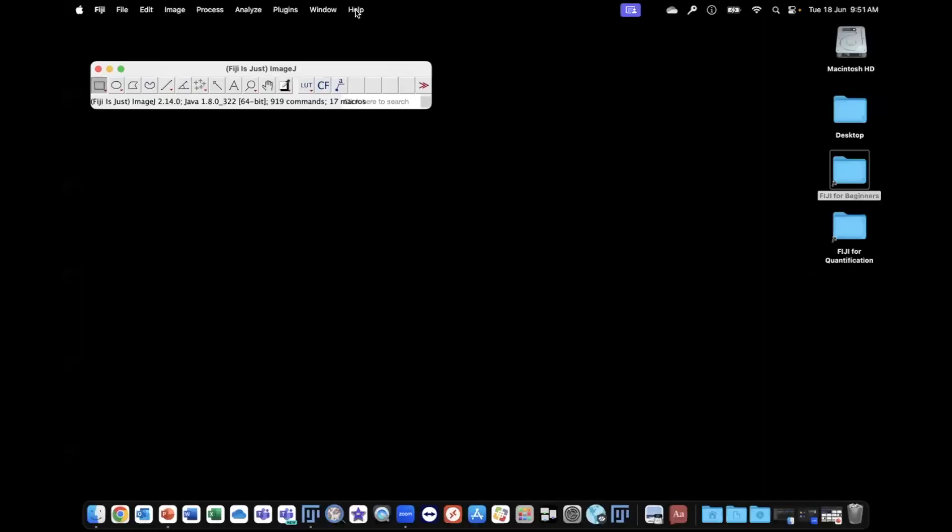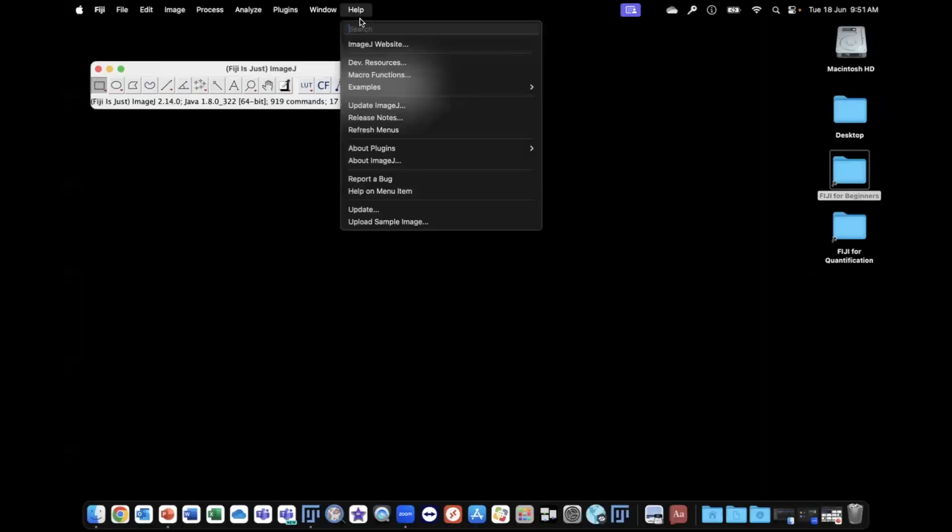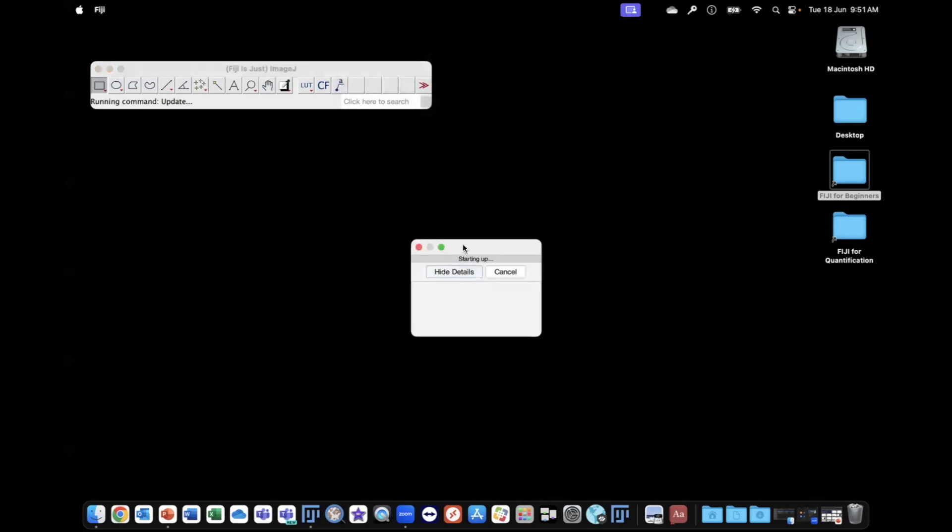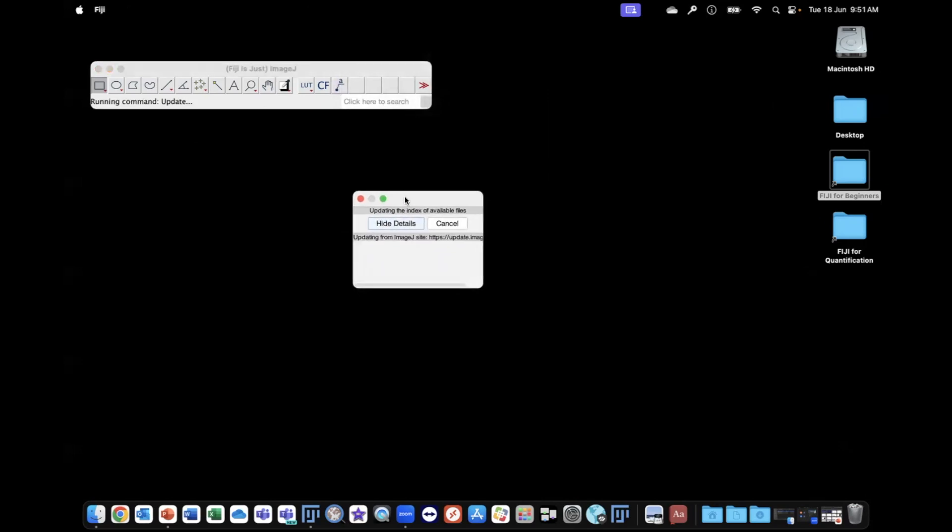So go to Fiji Update. This will check to see if there are any updates required.